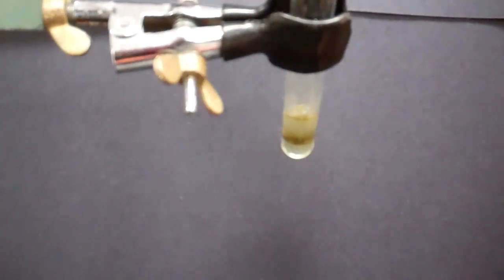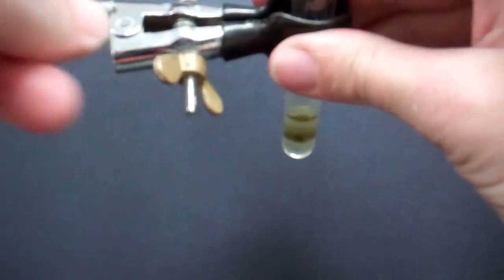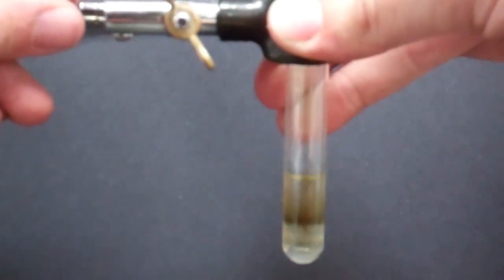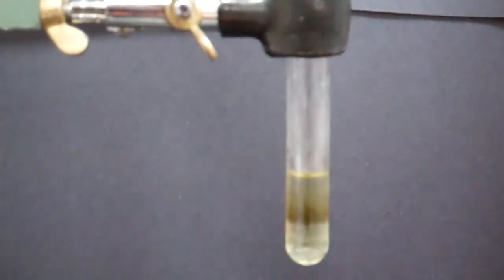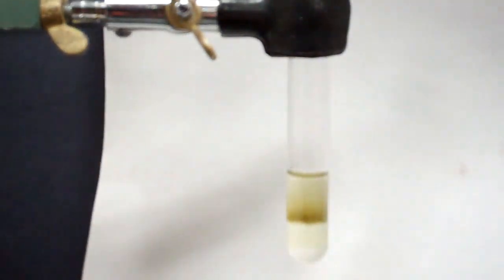We're letting that drip down the side of the test tube. We are not going to mix this step because what we're looking to form is at the boundary where these two solutions have come in contact. They've created a layer, and we're looking to observe a dark brown ring form between the two barriers.